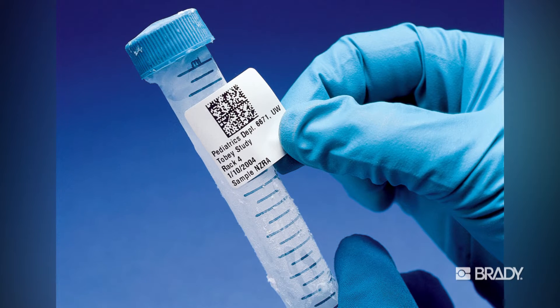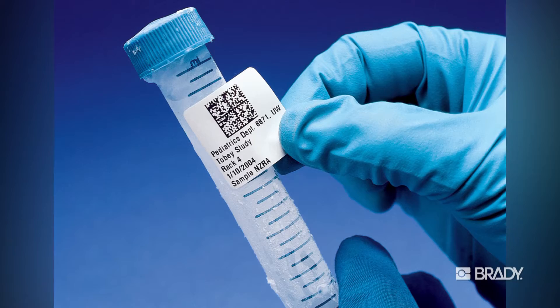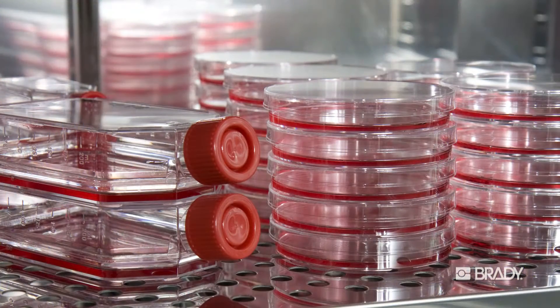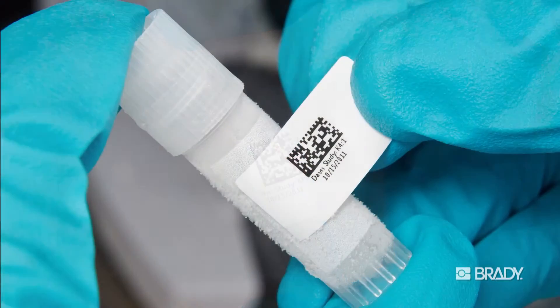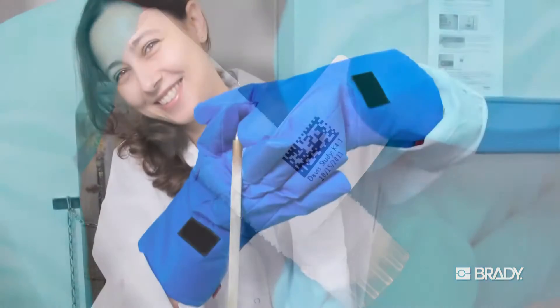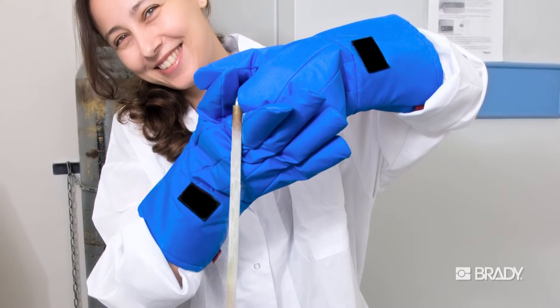Brady's Freezer Bonds laboratory labels were developed specifically for the relabeling of frozen biologicals, reagents, enzymes, and cell line samples. This label can be applied to new vials at room temperature or, as a distinctive feature, technicians can quickly and easily apply the label to already frozen centrifuge tubes, cryovials, or other laboratory containers.